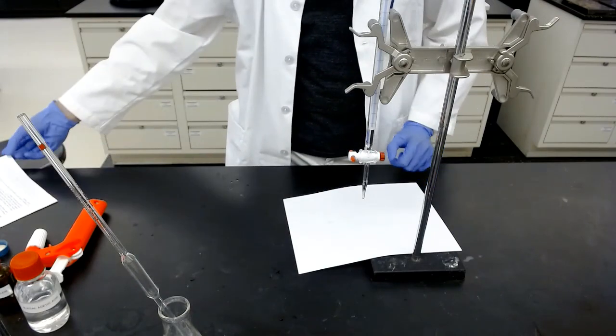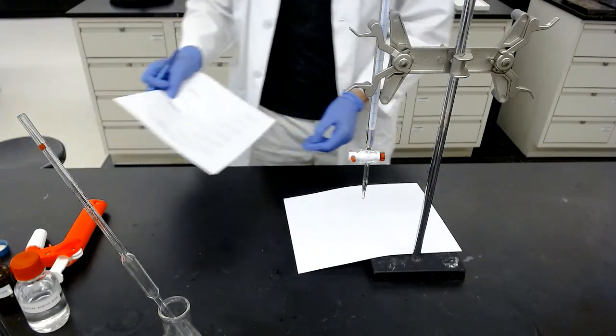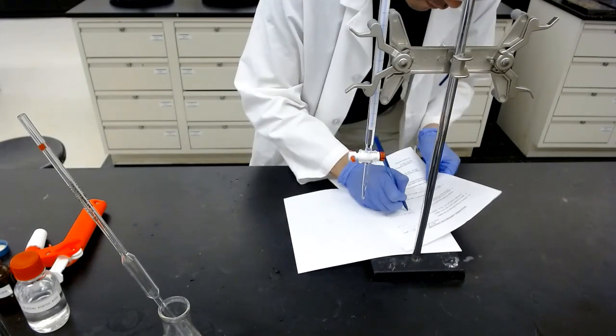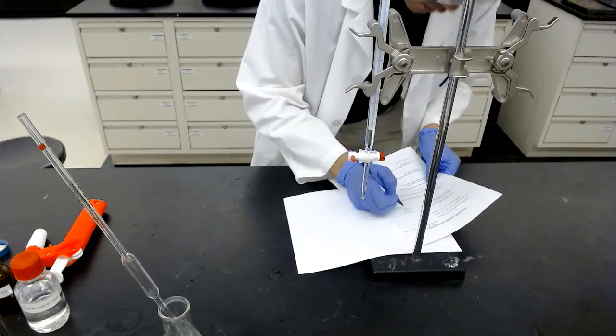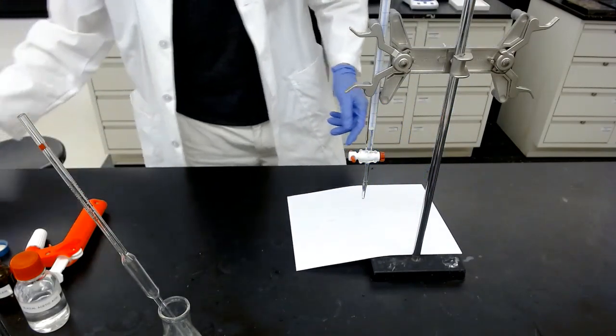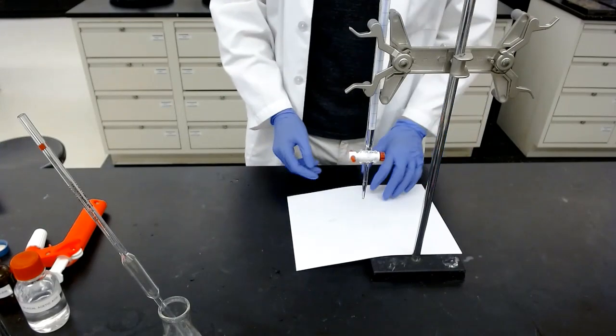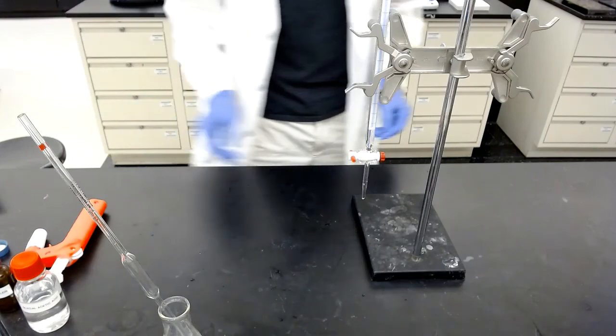So if you figure out how much less base or more base we used for the second titration: 6.53 mLs. Okay, 6.53 mLs. Yeah, it's less than the first time, which makes sense. All right, you think about it and tell me why does it make sense.